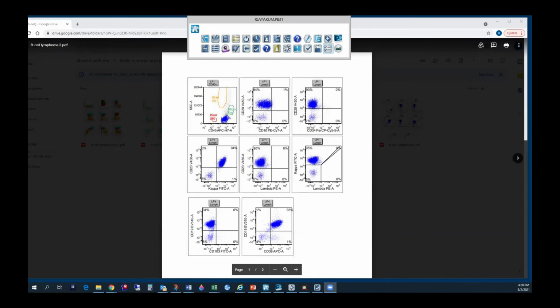So one other thing is that sometimes in 10 colors these days, they don't make these lines anymore. I have one coming, and I think my cases 5 and 6 will have that. There is no line there. So there they almost always decide positivity and negativity based on what a normal marker would be positive for. For example, if they're saying cytoplasmic CD3, they will compare that with the normal T cells. And if it is to that intensity, they will call it positive. Like MPO, that's what we used to do at MSK.